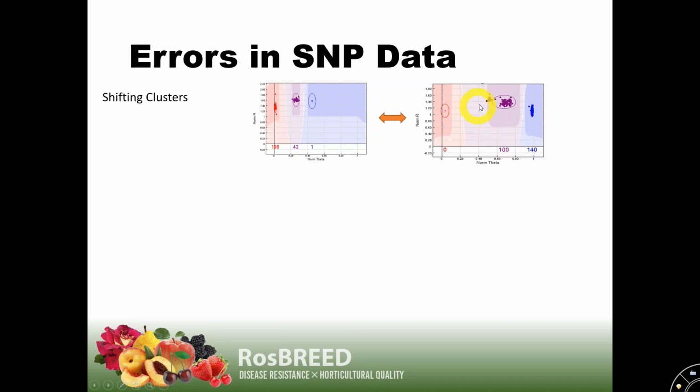Unfortunately, on this side, it didn't. So we as humans can clearly see 3 clusters, but GenomeStudio doesn't recognize them. So if you would just take this output from this SNP as it is, all these AA individuals, or most of them at least, are purple, which means they would have been given the AB genotype rather than the AA genotype.